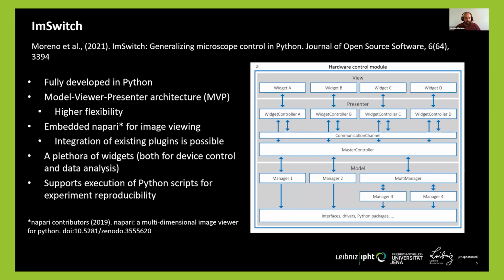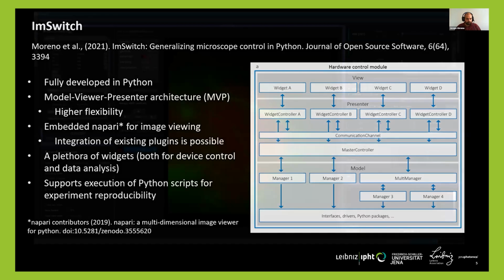related to Python. And at the moment, ImSwitch is presenting a lot of widgets that span from image processing to also device control. I'm not going to go into detail too much. I will show you the links to the code repositories. And like Oran suggested, we also have a module dedicated for running Python scripts that are embedded into ImSwitch itself. So to run normal Python scripts by connecting directly to the hardware that ImSwitch controls.